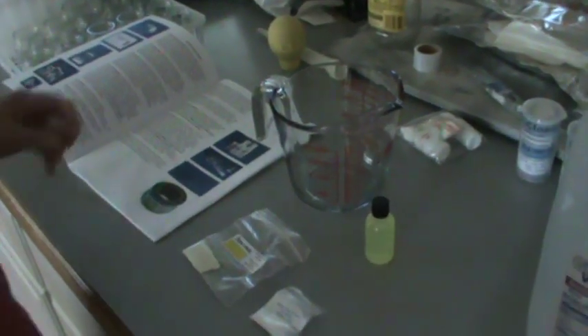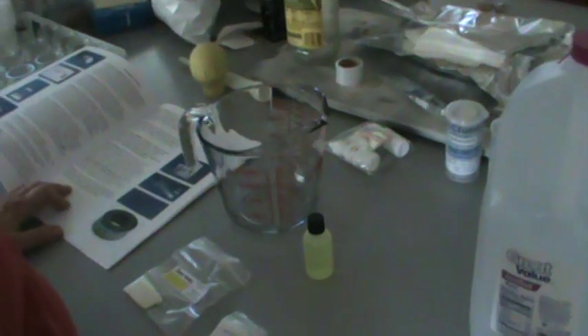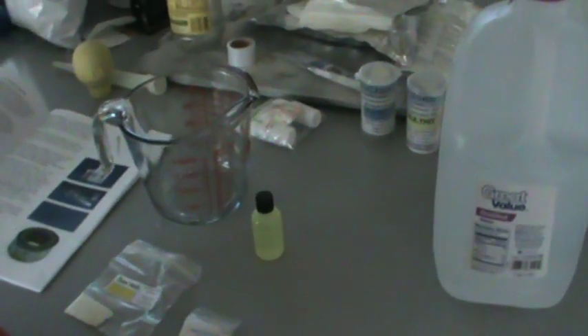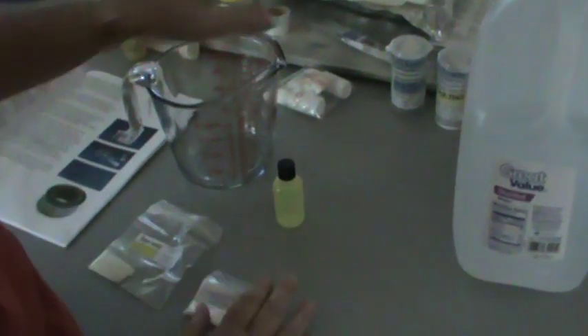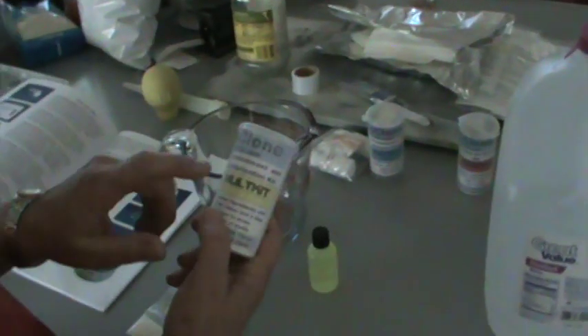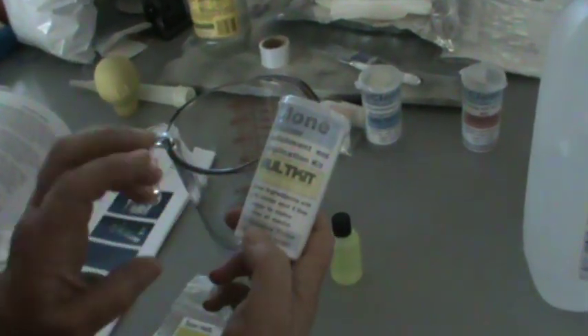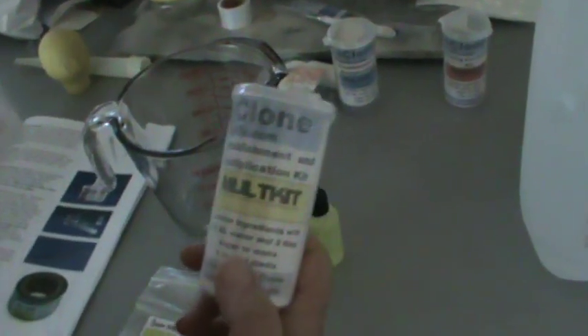Hello again from Okidoki Farm. We finally decided to take this step to get our tissue culture started. I opened up the multi kit for establishment and the multiplication.